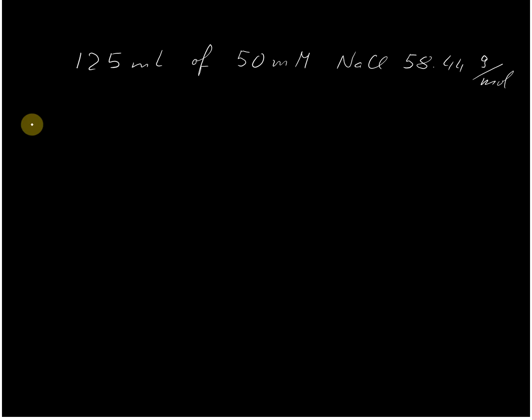So the first thing that we need to do is we write down the unit of what we are looking for. So we are looking for the weight, and that would be in grams. This is just simply to not lose sight of what we are actually looking for. The next step is a large line. This will be our fraction line. And we then do a simple dimensional analysis, and this works in the way that we say, okay, what do we know? We have this information here, and actually this last one, this molecular weight, actually has the unit that we are already looking for.